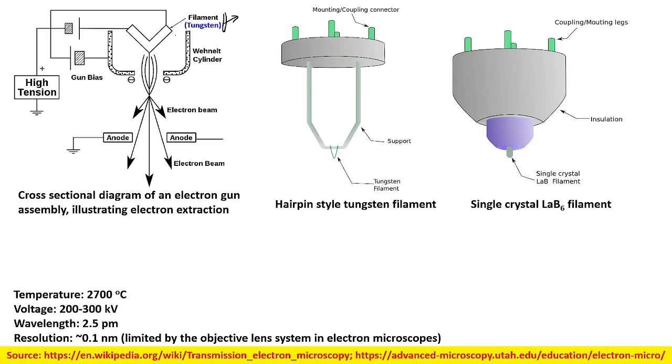Okay, now in the electron gun also, we have a tungsten filament, and it is heated at a very low voltage, approximately 6 to 12 volts. This is used to energize the tungsten filament, and when it is heated with that small voltage, the electrons are generated, but these electrons do not have sufficient energy to come out of the filament.